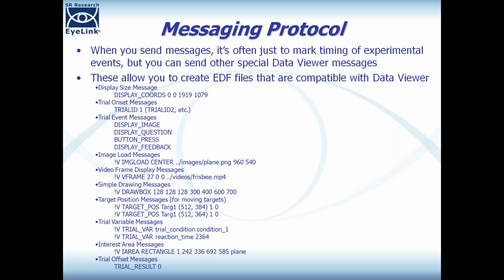You can refer back to this slide later to remind yourself of all the different options. But we'll go through these one by one here. Basically, in this slide I'm trying to describe the type of message and then give a quick example of what that message looks like. And so these are the different things we'll talk about.